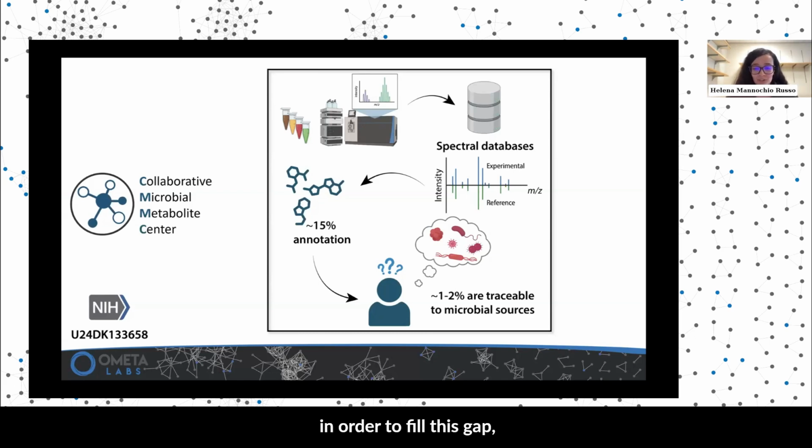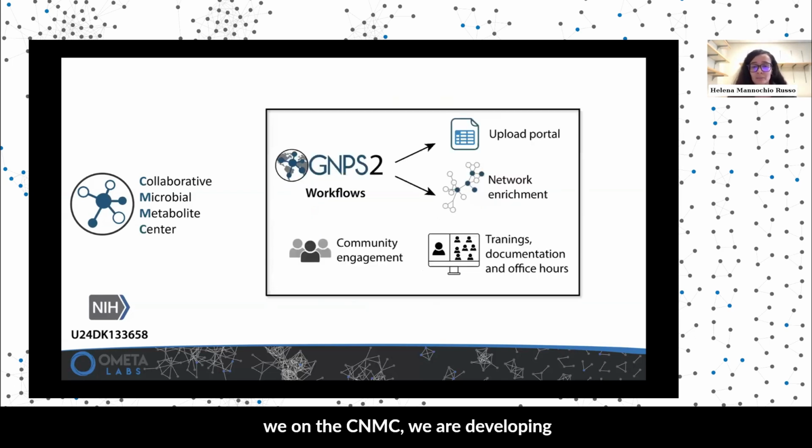So in order to fill this gap, we on the CMMC are developing workflows to make the annotation of microbial metabolites more straightforward. So we have developed workflows in GNPS2.